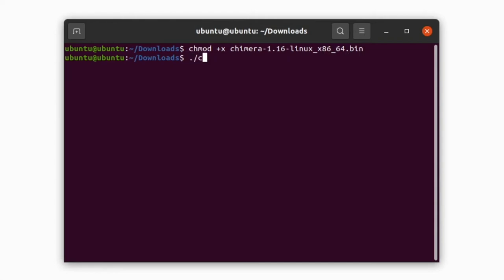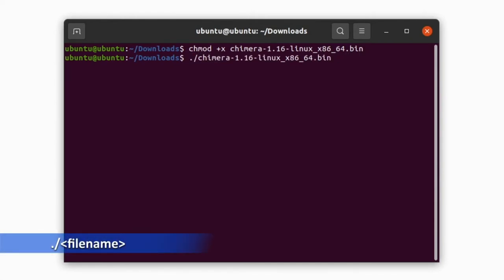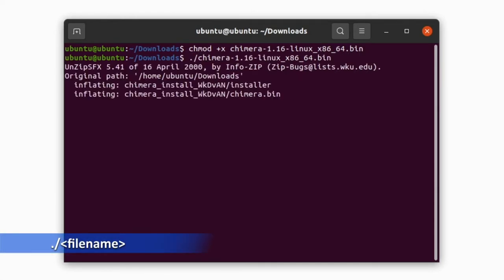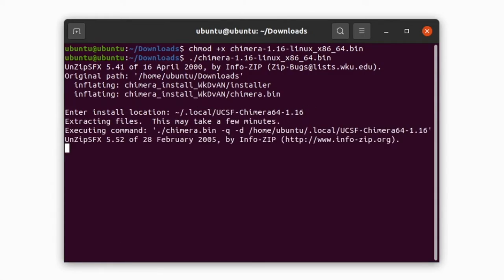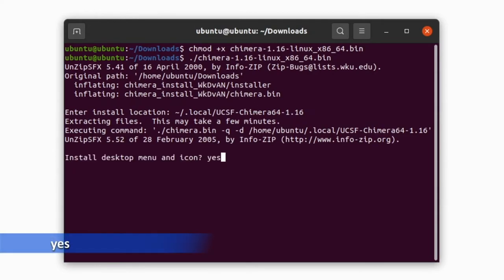To install the software, give this command: dot slash and the name of the file. When asked to enter the location, accept the default location and accept the desktop icon as well.